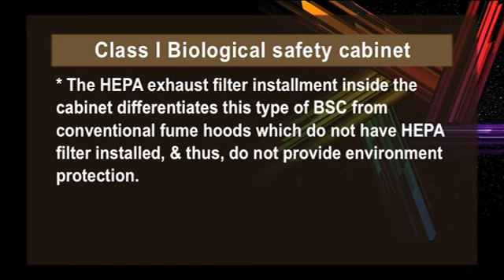The HEPA exhaust filter installed inside the cabinet differentiates this type of biological safety cabinet from conventional fume hoods, which do not have a HEPA filter installed, and thus do not provide environment protection.